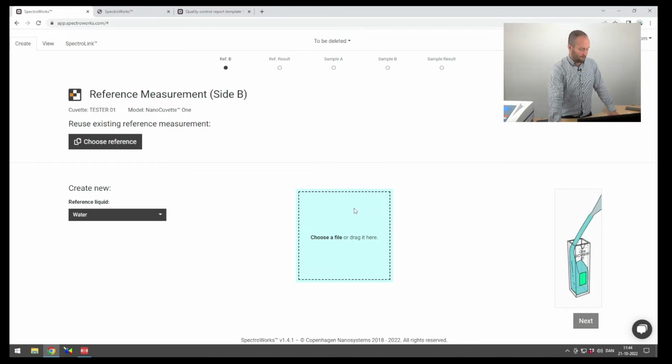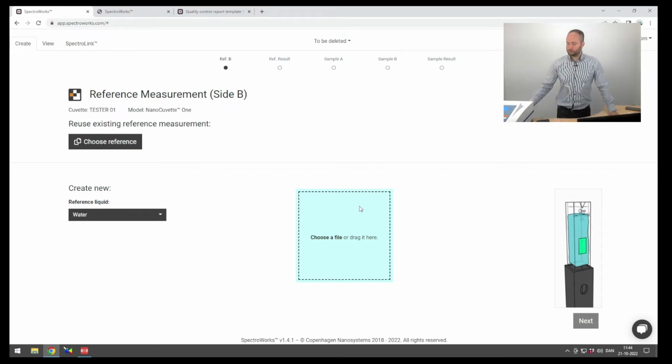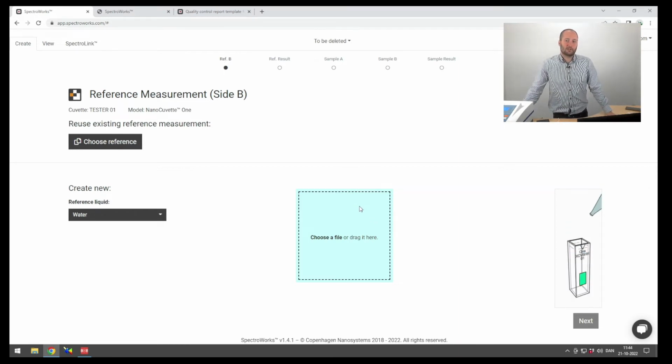Yeah. And of course, once it becomes a daily practice, they would rather sign up for the link system, because it more or less cuts any potential errors out. Yes, so they just have to pay attention to the quality of the filling of the cuvettes. Exactly, the cleanliness of the cuvettes. So you can look at it as an upselling cycle: the NanoCuvette allows them to do new novel measurements, and the link makes their work more effective. So it really depends on what they want to do.